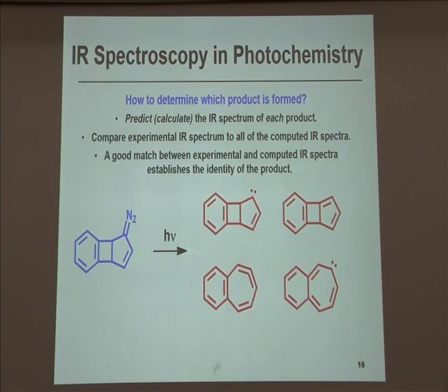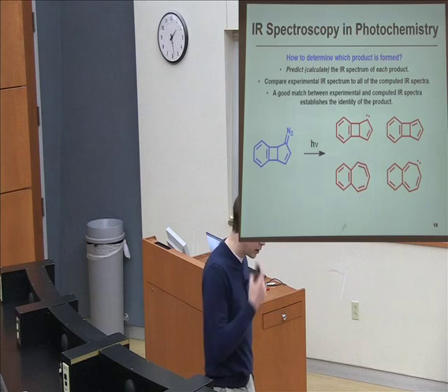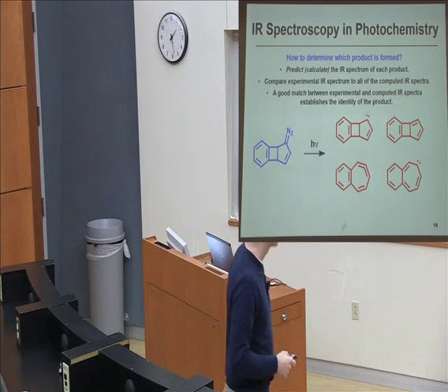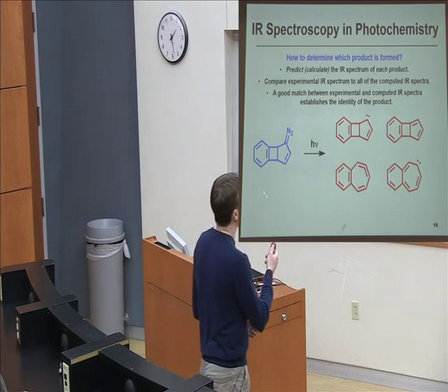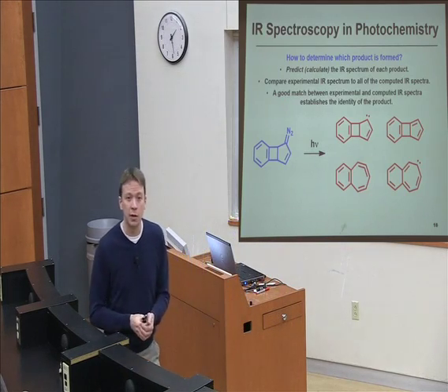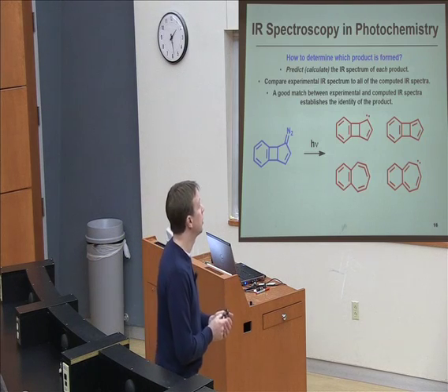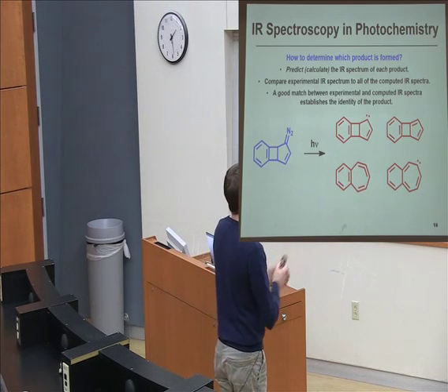And this is also another one of those examples, and this is again coming out of the McMahon group. This is a slightly different application of IR spectroscopy. This is actually IR spectroscopy used to follow a chemical reaction. And it's one that NMR, both the proton and the carbon NMR, would not be particularly useful for, because this reaction needs to happen at about 10 Kelvin. This is kept very, very cold. That's minus 263 degrees Celsius, so it's not really amenable to putting in an NMR spectrometer.